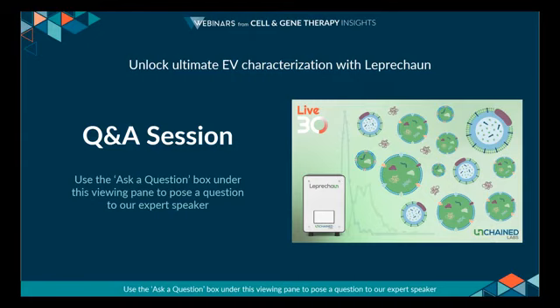That's really helpful. Our next audience member asks, does plasma EV analysis require an SEC pre-fractionation? You can do. I think we'd always recommend with plasma EVs, try it unpurified first, because you should be able to get good quality positive signal, and if you can, then you're going to be getting more accurate data because you're not introducing any bias from the cleanup step, whether that's SEC or anything else.